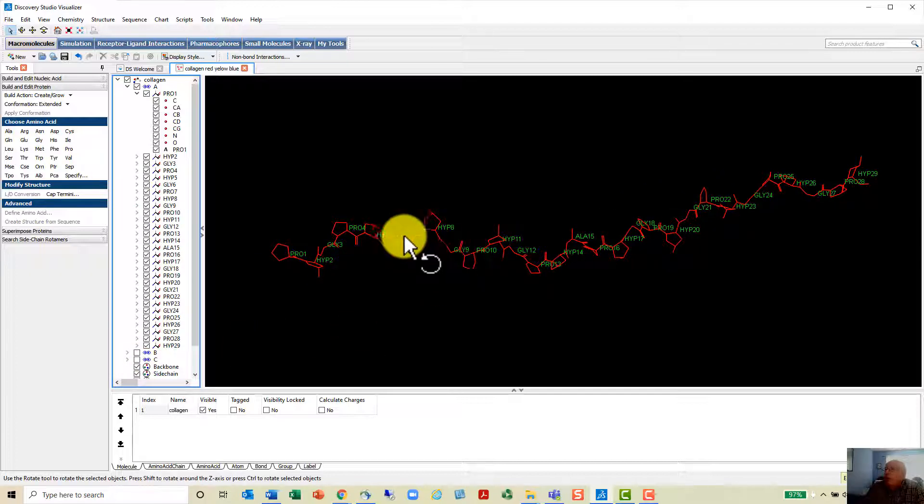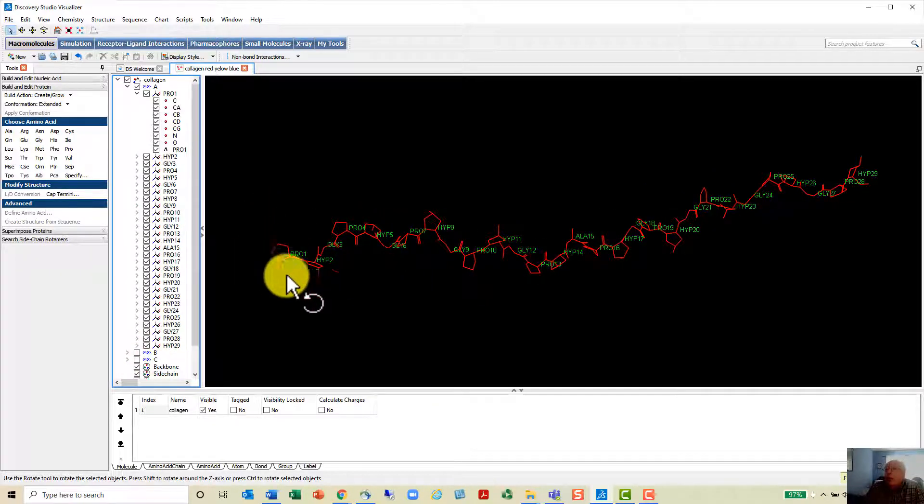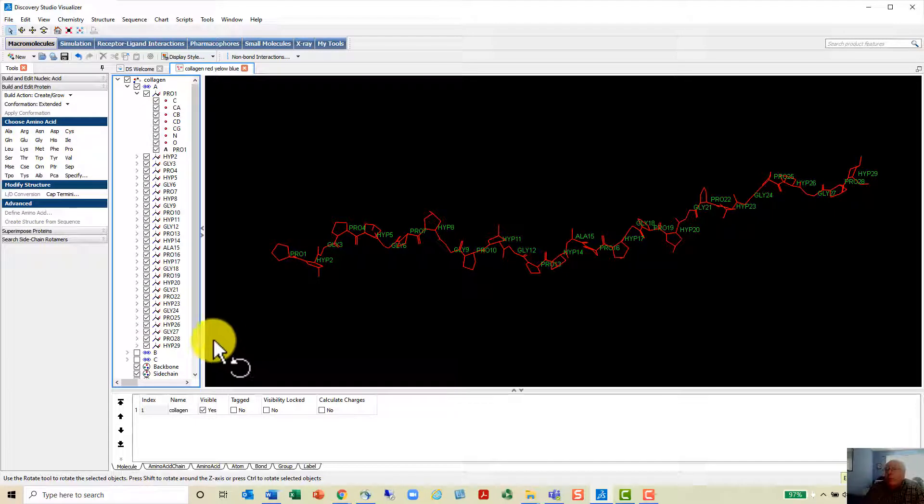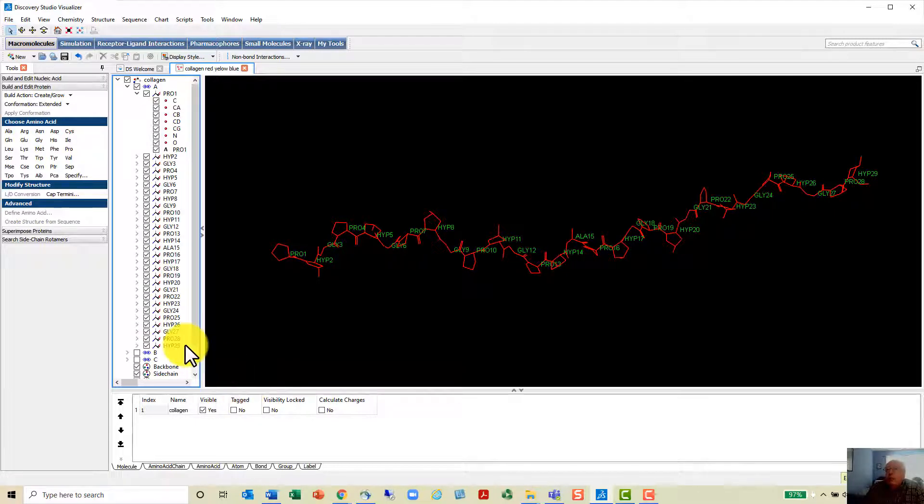Then you can see the structure of each one there labeled here. It's kind of neat. It's a nice easy tool to use.